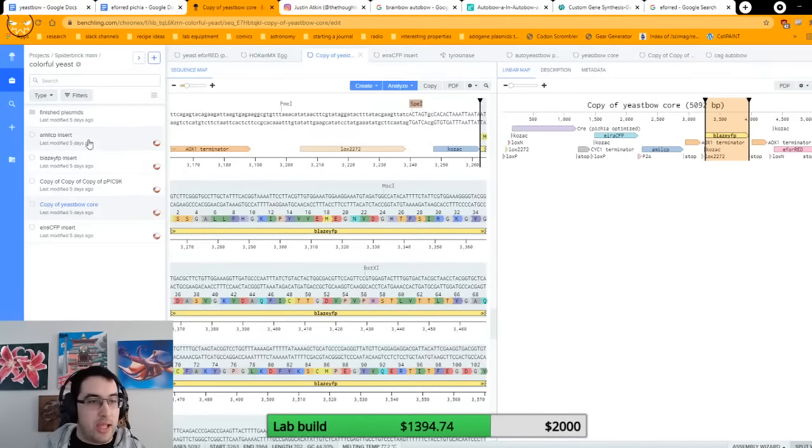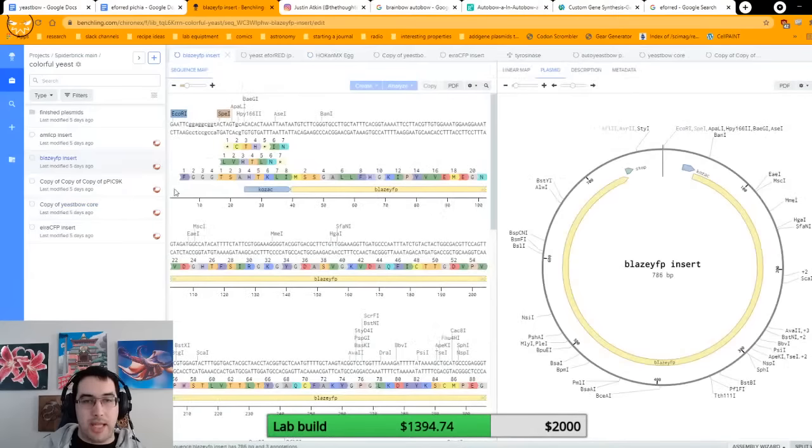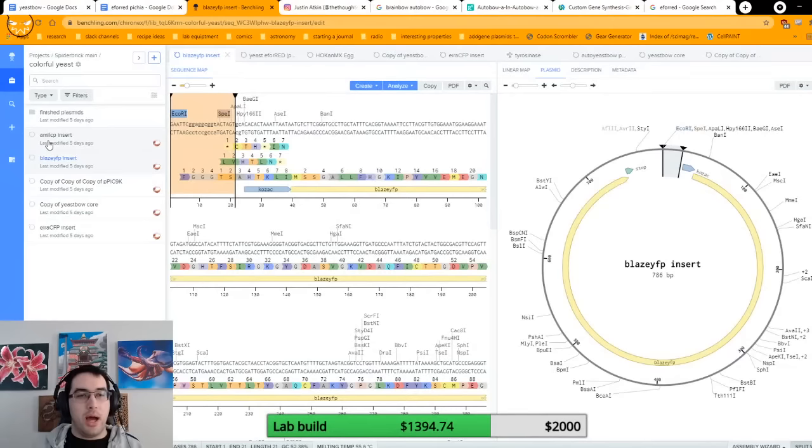To fix that, I essentially had to make adapters. This is the adapter here. It's this piece here. Basically I need them to print this little piece, and once they isolate the big chunky piece, they print the adapters, cut the adapters, and then stick the adapters onto the piece they isolated, so that the whole thing fits into the backbone.